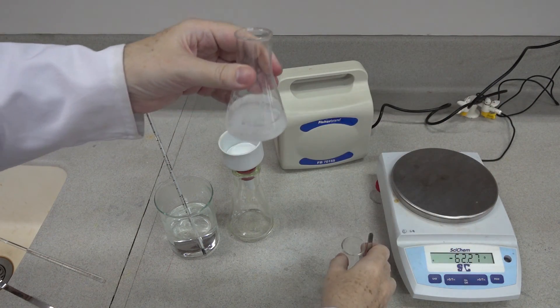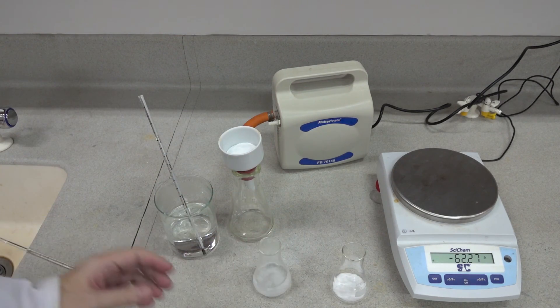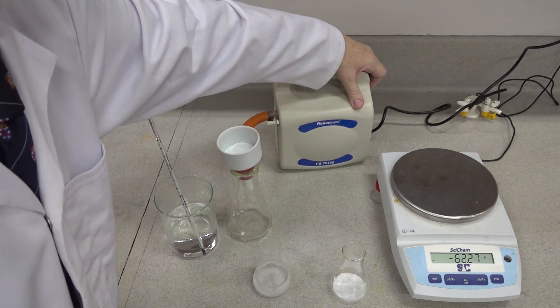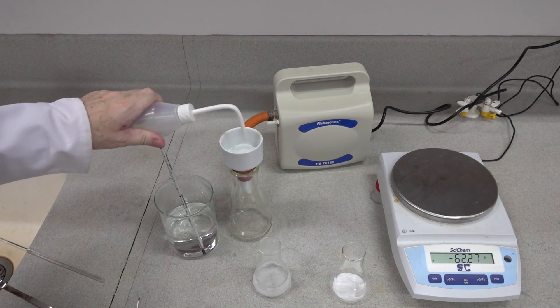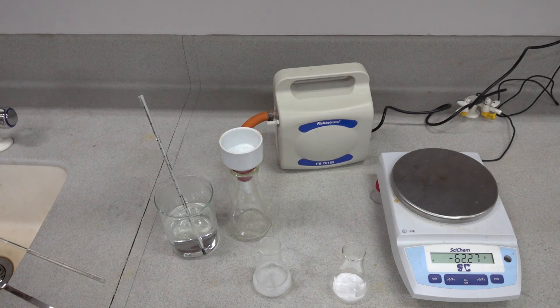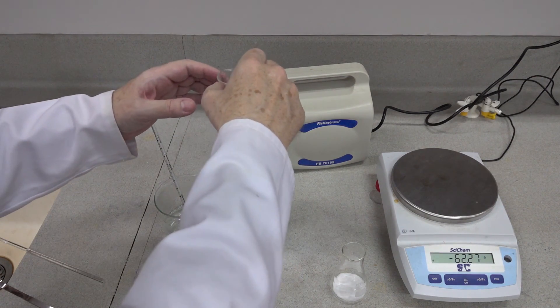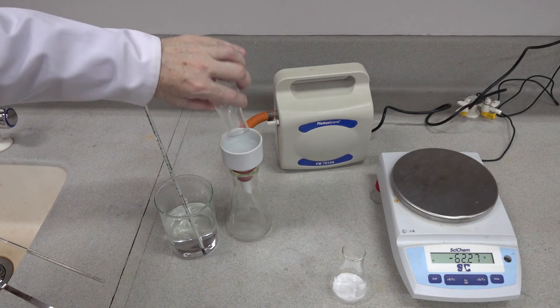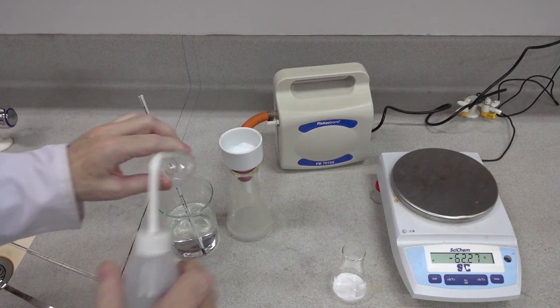Save the filtrate and see if we can crystallise some more product from that with time. So the same procedure as before, and connect the pump.